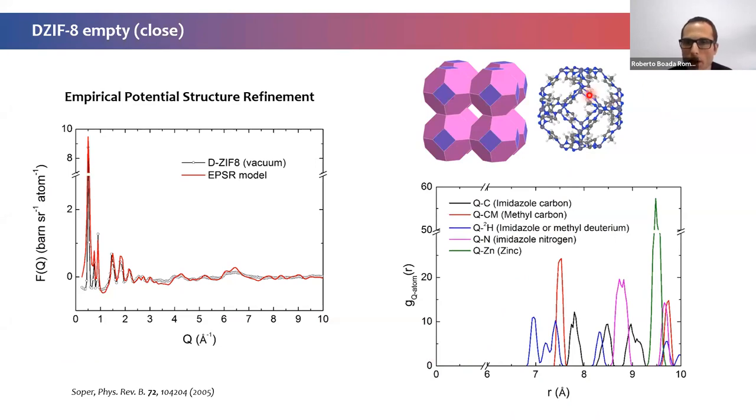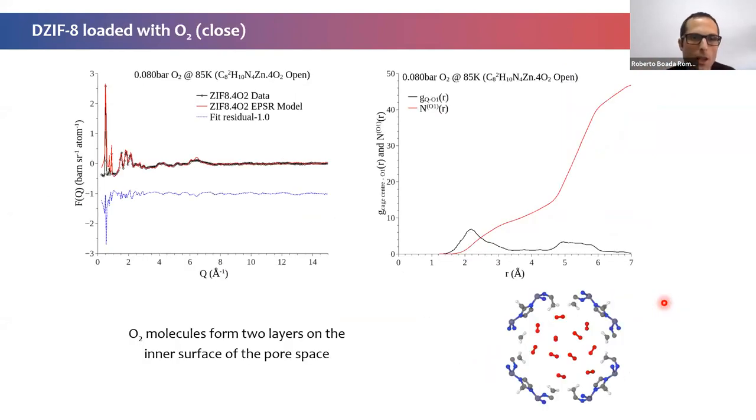So there would be a Q atom, kind of an imaginary atom in the center of the cage, just to have an origin. And in our structure, we could monitor the different positions of either the atoms of the structure or the gas molecules. So we were loading first oxygen, at a low pressure of oxygen. We could see that there were four oxygen molecules per formula unit.